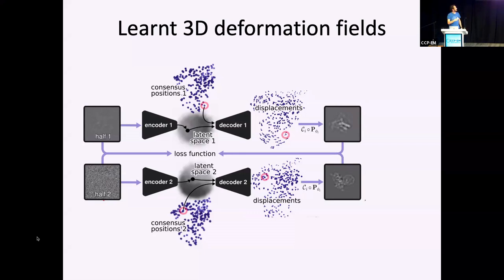New to our approach is how we regularize these Gaussians, and I'll come back to that. Plus, we now also divide this separately into two halves of the data. So we independently refine two completely separate VAEs because of keeping things gold standard, and I'll also come back to that.